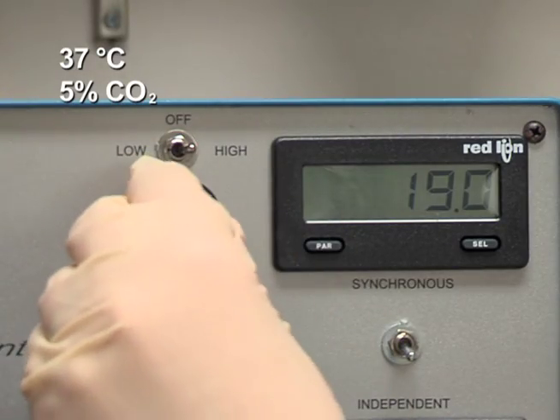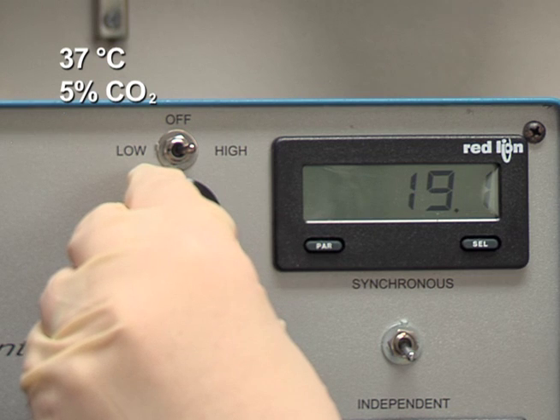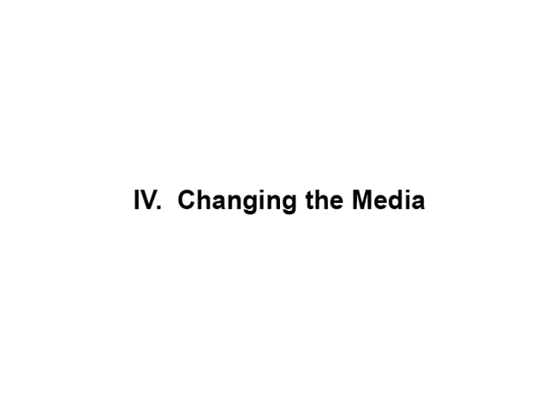Start the rotation at 19 RPM in a cell culture incubator. For optimal culture conditions, replenish the media every other day for the first three days and daily thereafter.